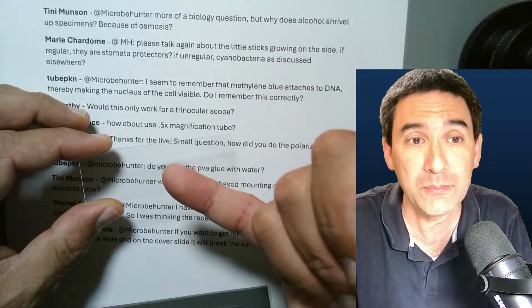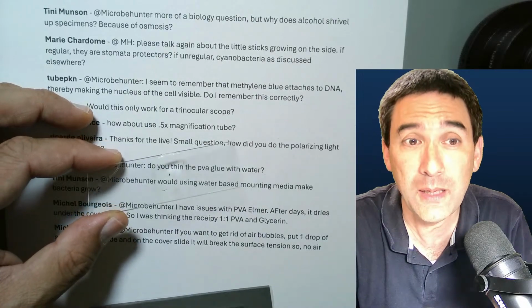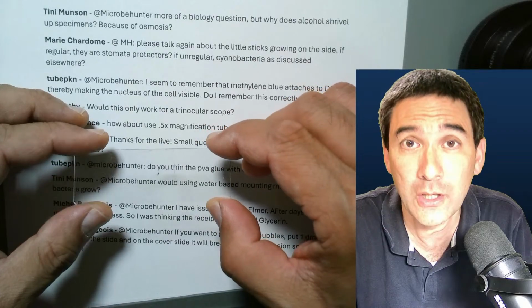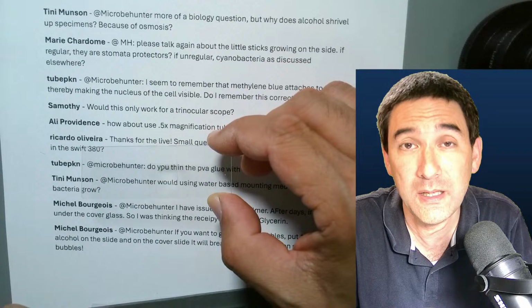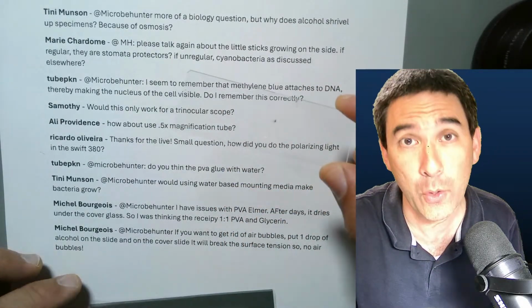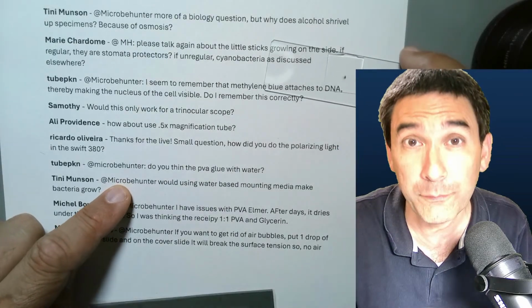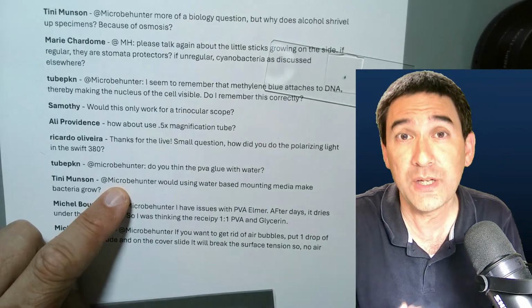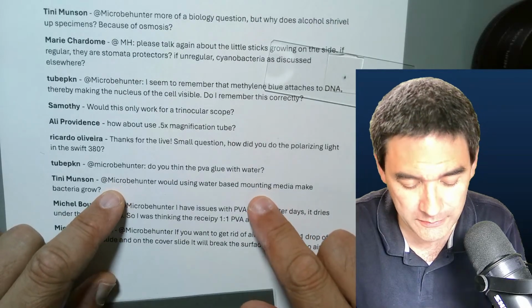And all of a sudden, after some time, you're going to see bubbles forming directly inside the specimen. The reason is that bacteria have become active and started to produce those gases, decomposing the specimen. For this reason, you do not want bacterial growth if you want to make a permanently mounted slide. Now, I know that sometimes you actually want to observe the growth of bacteria. In this case, of course, you need a nutrient medium so that the conditions are such that the bacteria want to divide. But then you do not have a permanently mounted slide.